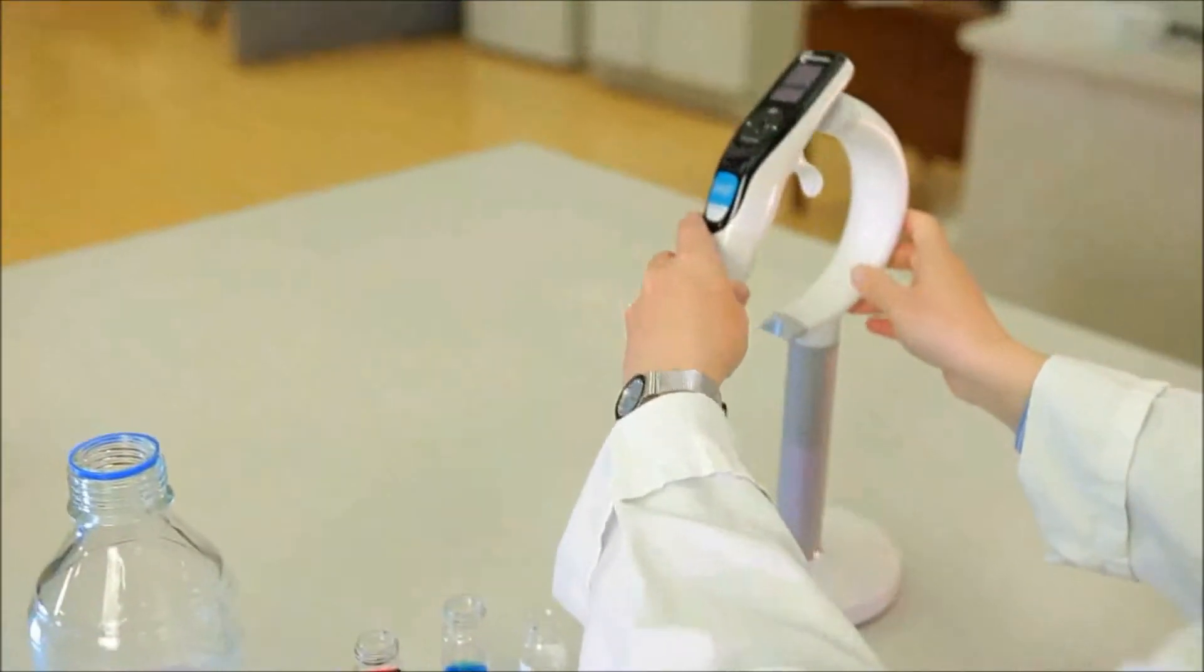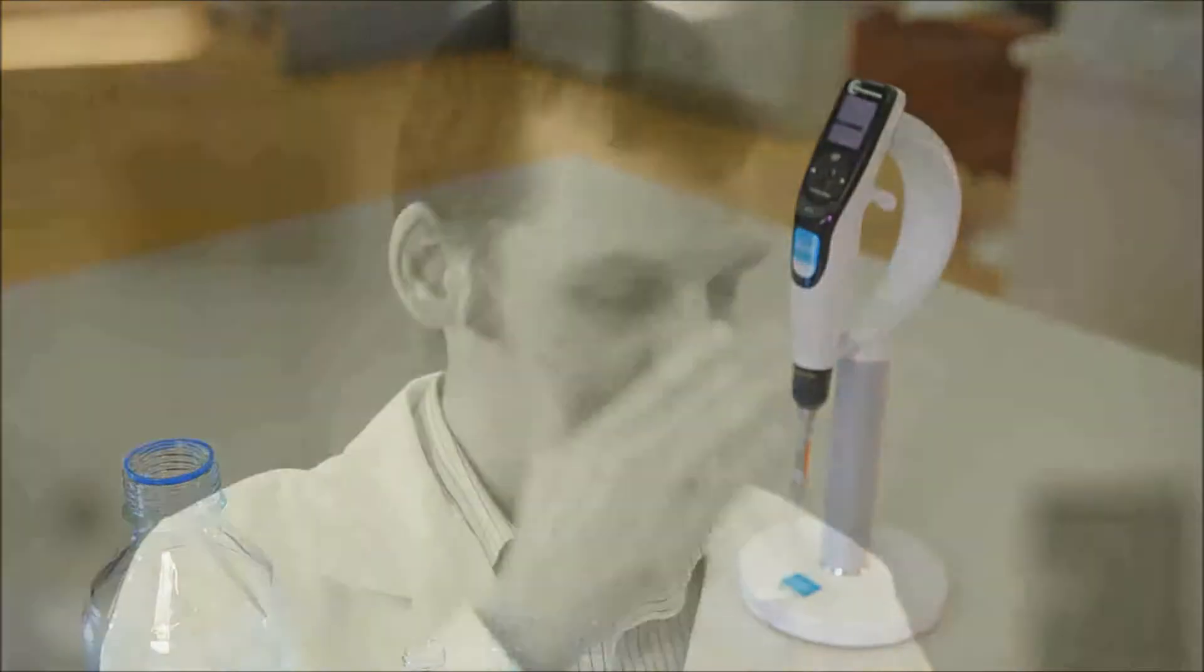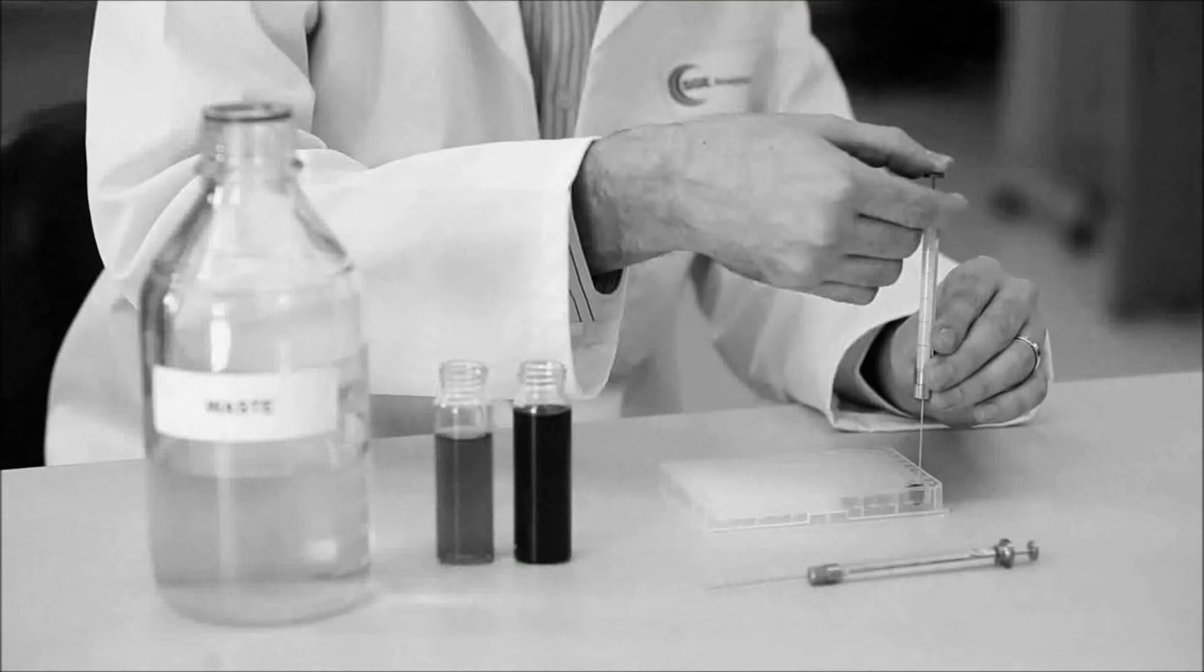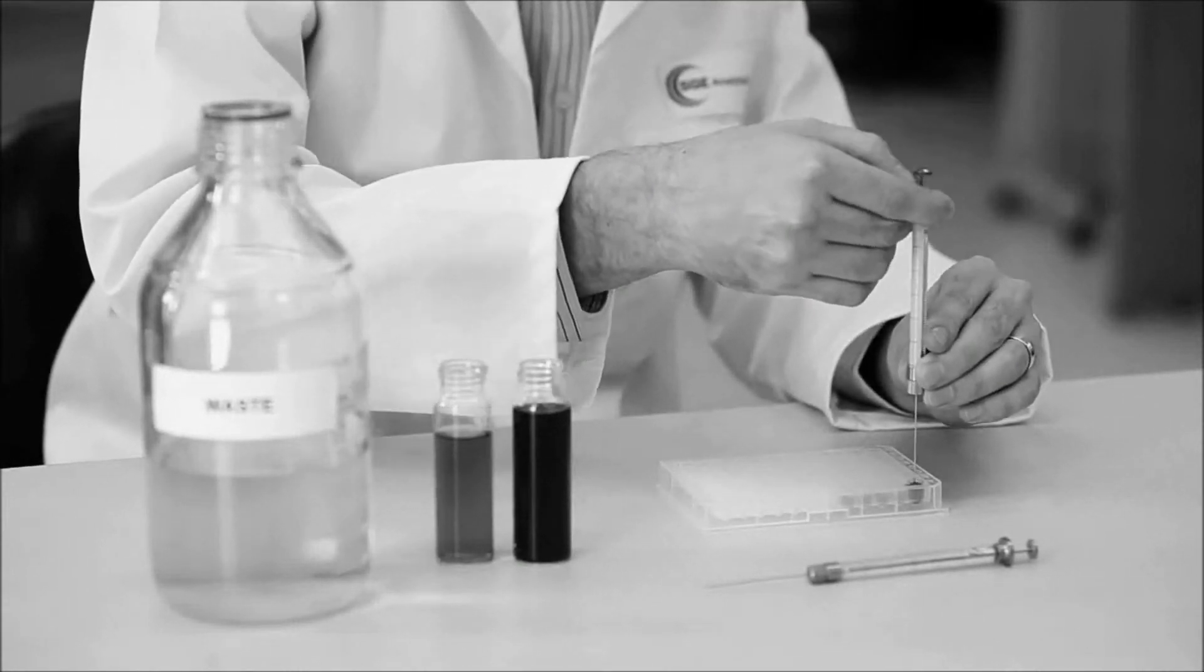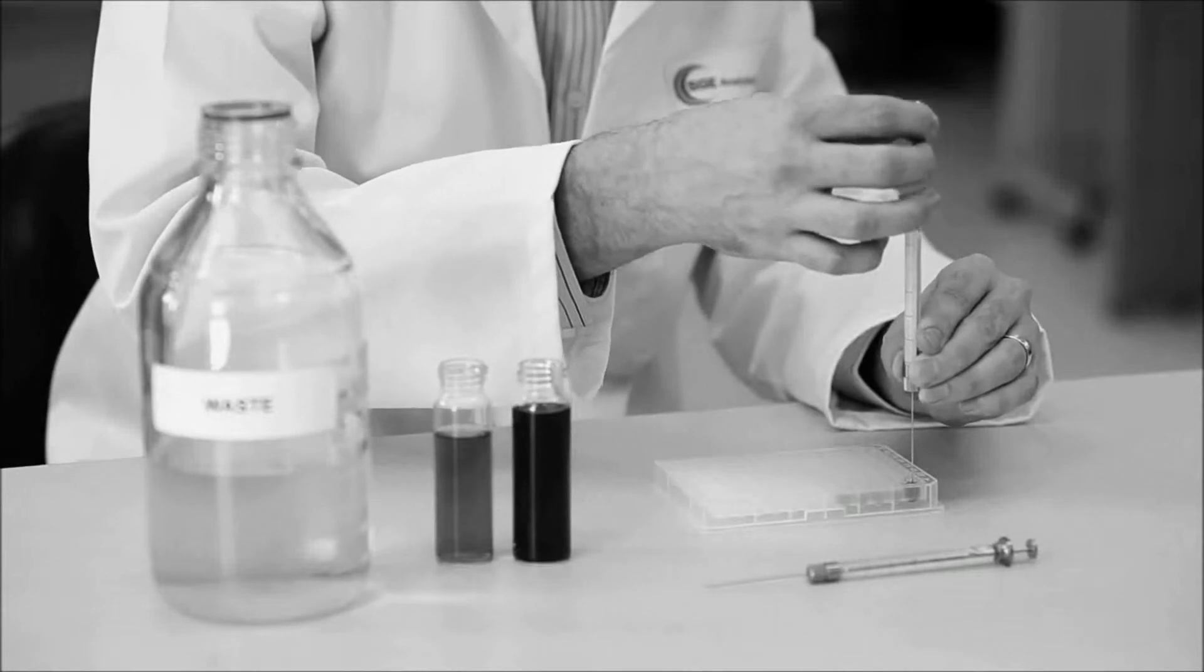And that's it! Now Catherine is moving on to her next task, while Mark has only just gotten started. The accuracy of EVOL even allows you to skip steps in a serial dilution if you only require the final volume. This is difficult to achieve with the manual syringe.